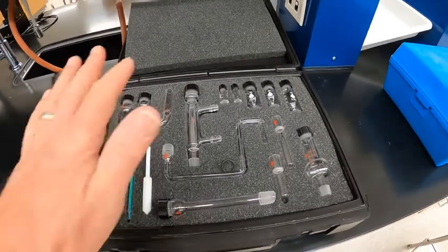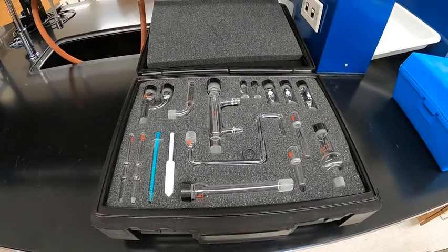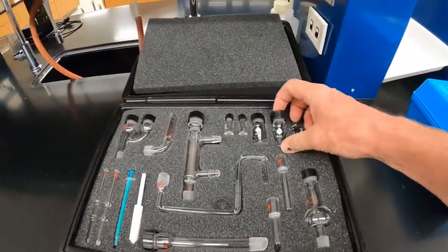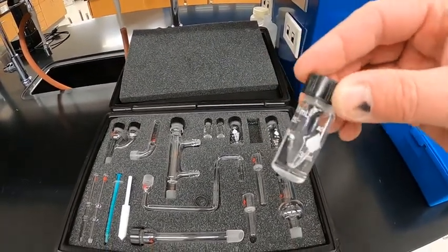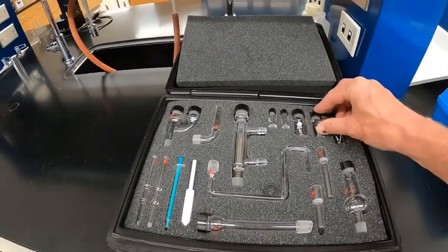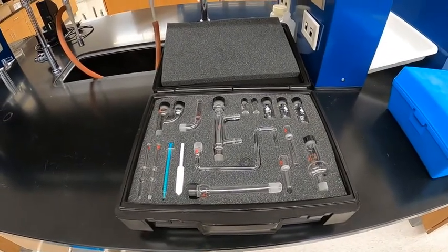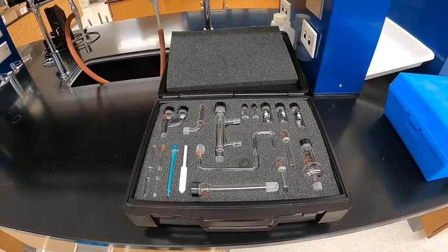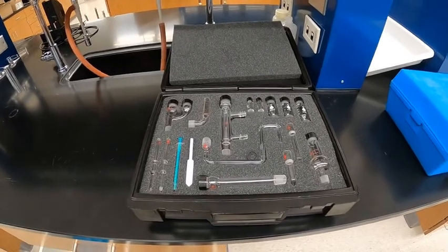You can see in here that most of the glassware is smaller than my hand. Today we're just going to be using a 3 milliliter conical vial, and if you look carefully at the bottom you can see that it has kind of a V shape. This kind of glassware allows us to use much smaller volumes and therefore use less materials and do things more safely.